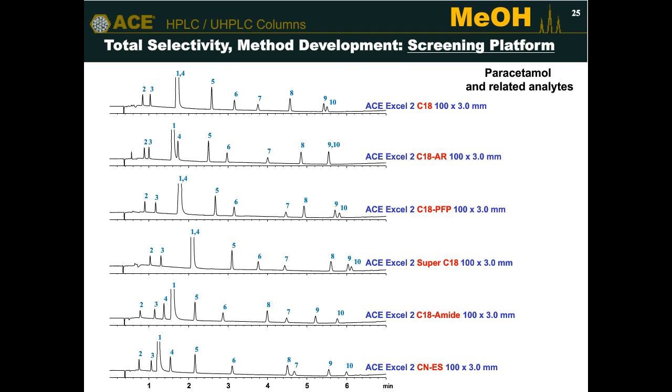Now, the example I've put on the screen there is a simple LC-UV example. Of course, in real life, we use LC-UV-MS. So we can then try and understand molecular ions, some type of ionized information from the MS detector to help us track the peaks.